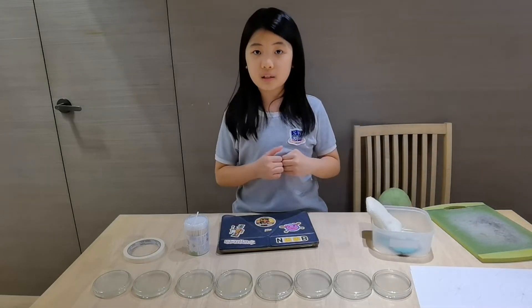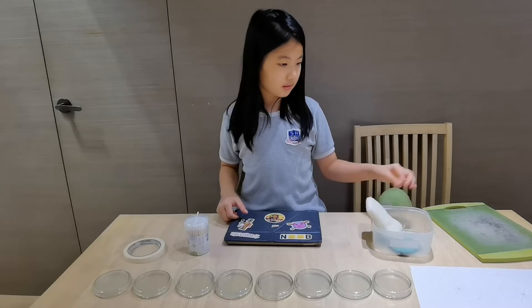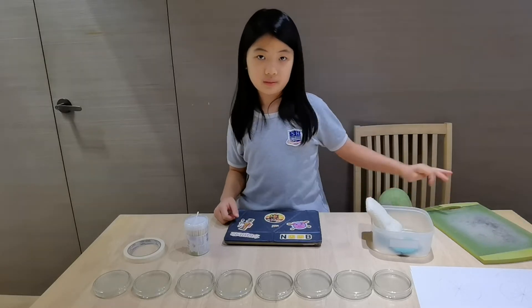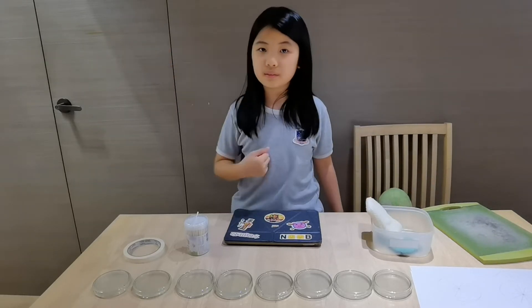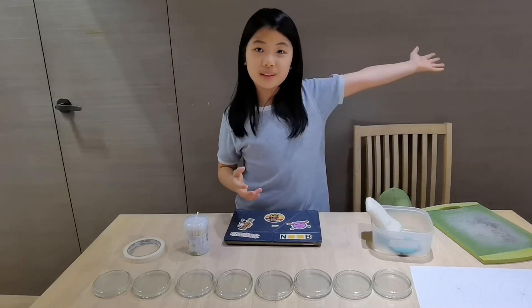My test subjects will be my iPad, a sponge, a cutting board, the door handle, the fridge handle, the toilet, and my favorite toy.